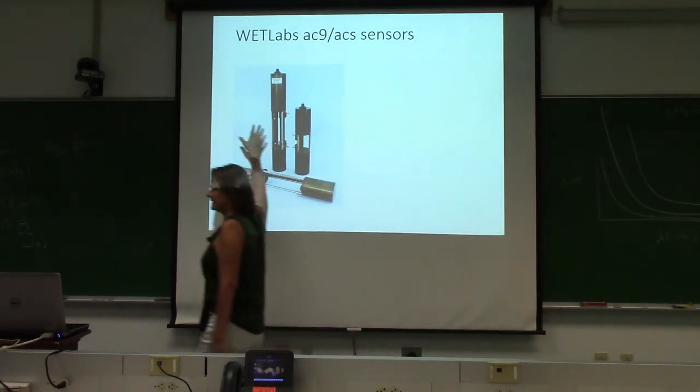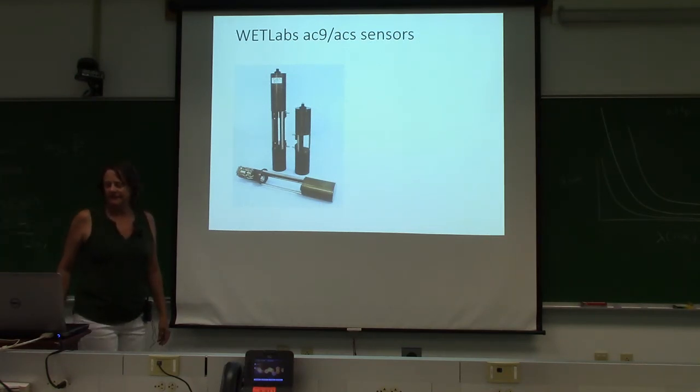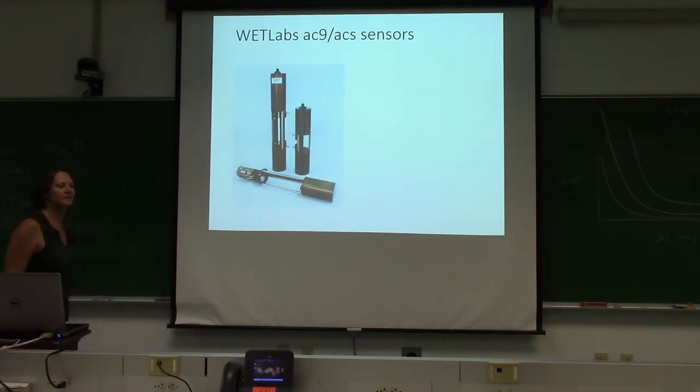How many people have worked with an AC meter before, a WET Labs AC meter? 1, 2, 3, 4, 5, 6, 7, 8, 9, 10. Okay, half. Excellent. Hopefully even you who have worked with them a lot will learn something today in lab.